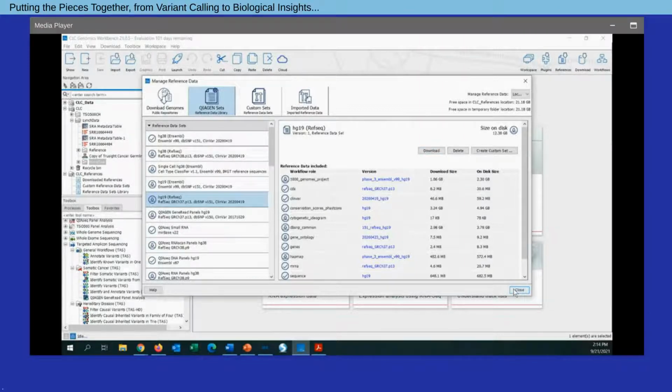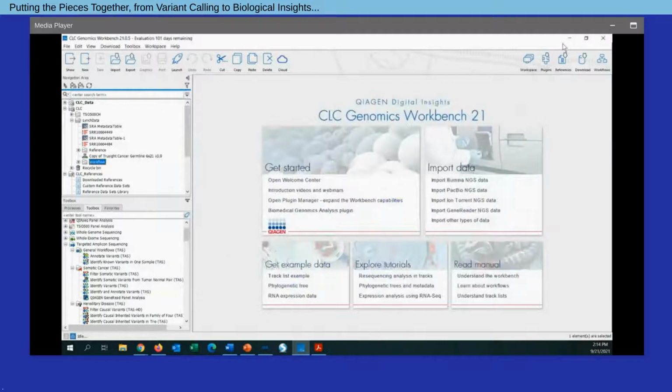With that step already done, the next step that I would do is one of two things. If I'm going to work with my own samples, I'll show you how we can import those in a minute. But again, for our example with Lynch syndrome, we're utilizing public data. And very nicely, if you direct your attention to the top right corner of the screen, the Workbench has a built-in downloader for pulling FASTQ information from the Sequence Read Archive.